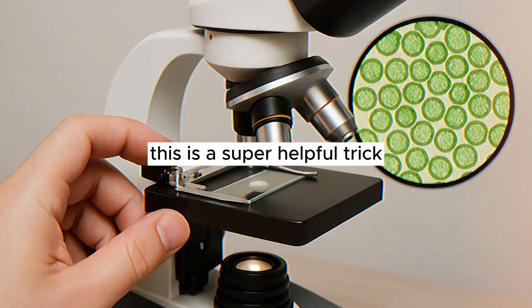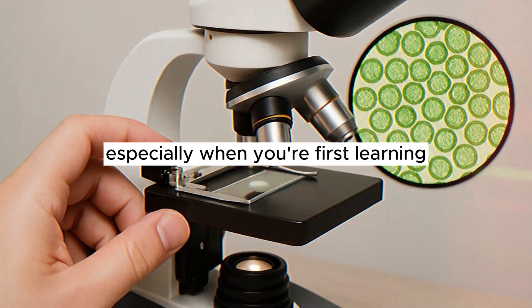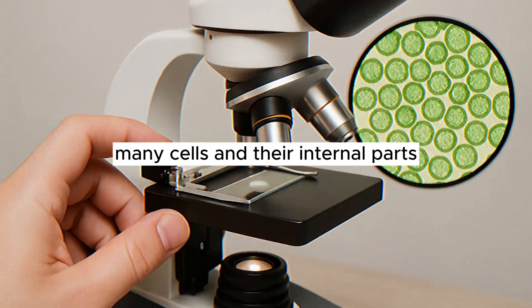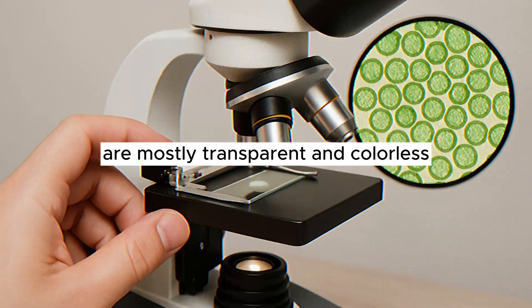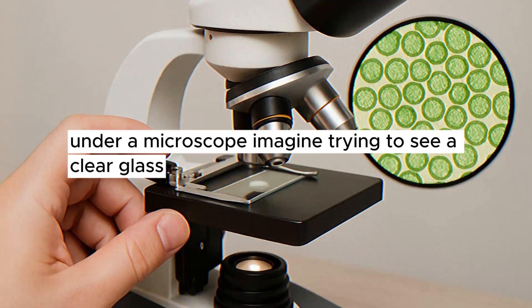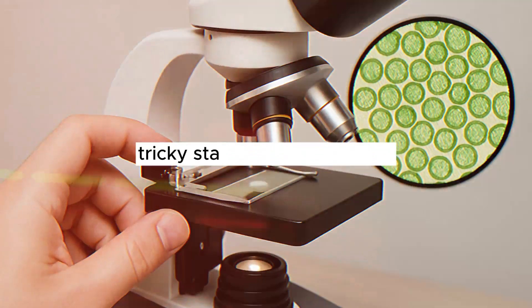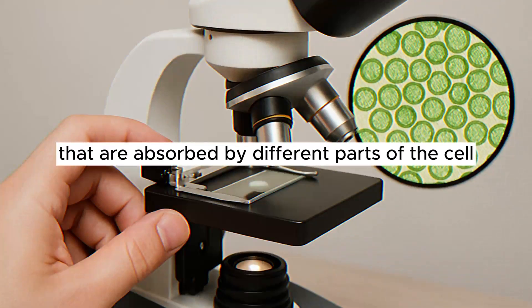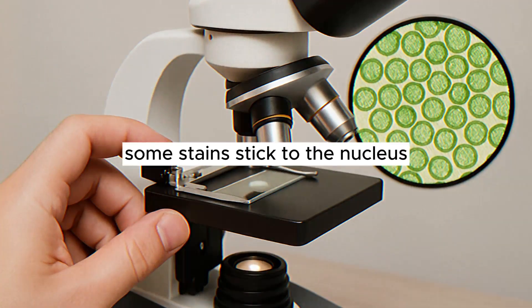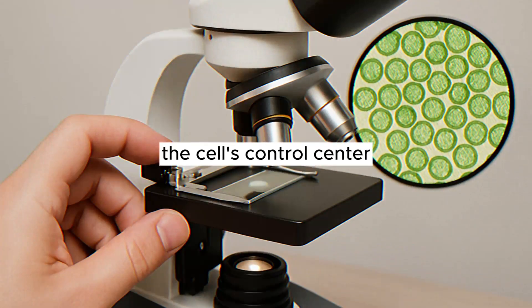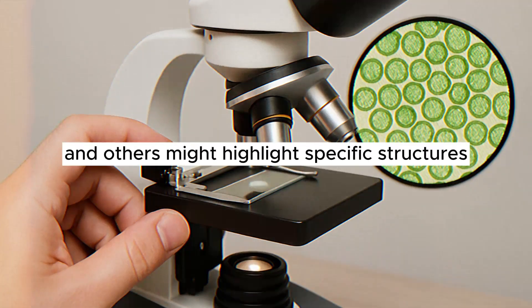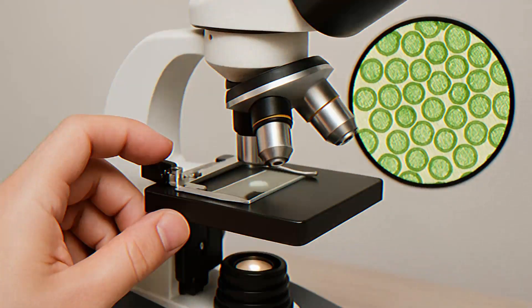Ah, staining. This is a super helpful trick, especially when you're first learning or looking at animal cells. Many cells and their internal parts are mostly transparent and colorless under a microscope. Imagine trying to see a clear glass marble against a clear glass table. Tricky. Stains are special dyes that are absorbed by different parts of the cell. Some stains stick to the nucleus, the cell's control center, some stick to the cytoplasm, the jelly-like filling, and others might highlight specific structures.